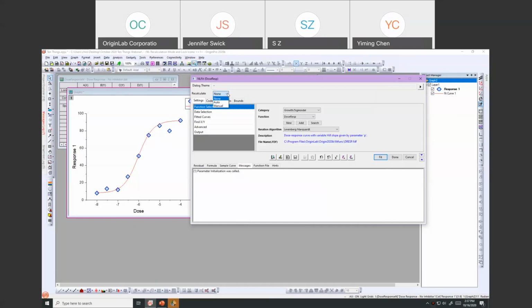The final mode is auto. If you specify auto, then Origin knows it's watching that source data, and as soon as that source data changes, Origin is going to rerun that analysis. Auto makes sure your data and your analysis results stay in sync. I always encourage people to use auto. That way, they know for sure that their data and their analysis are in sync. So I chose auto here. Let me finish my fitting, and we'll get to the next topic in recalculate.